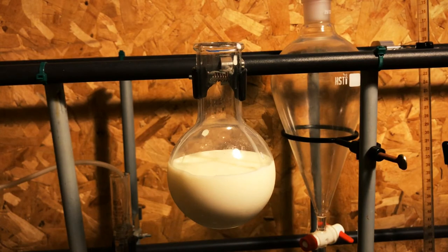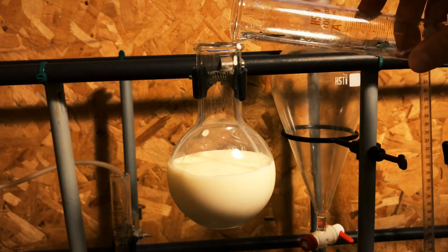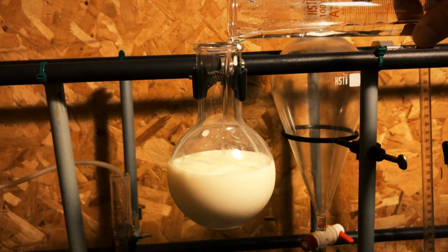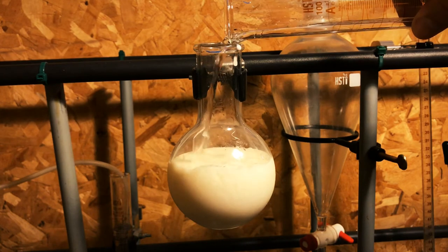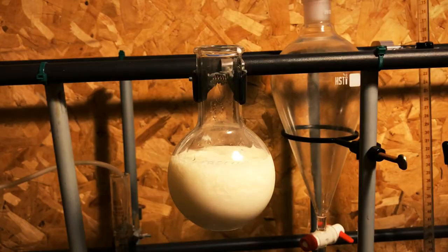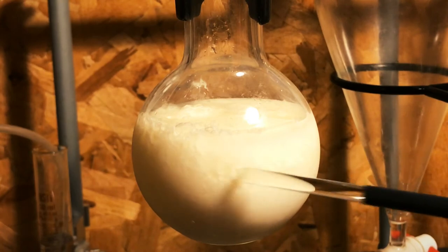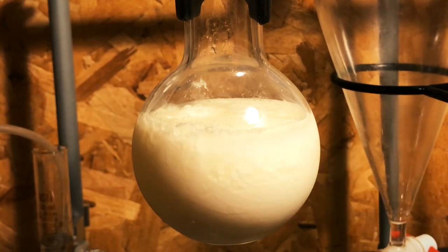Now to the milk, I'm going to add approximately 20 milliliters of acetic acid. If you look very closely, you can see a precipitate being drawn out of the solution. This precipitate is casein.